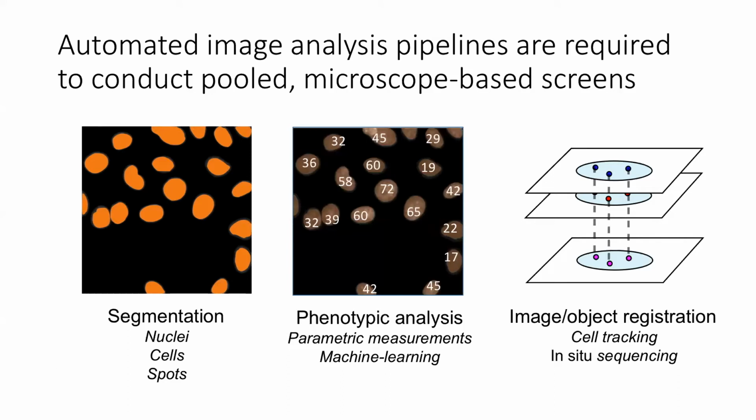The next thing you need to be able to do is your phenotypic analysis. This can range from really simple things like fluorescence intensity to really complicated things like morphologies that are assessed using machine learning. If you're thinking about the phenotype you're interested in, one thing you may want to be aware of is how difficult that phenotype might be to actually assess using microscopy.